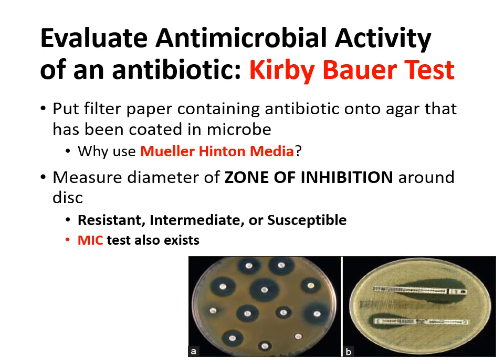When you do this test, you should be using a Mueller-Hinton media. So that means instead of the TSA plates that you've seen us use for a lot of our other experiments, you would use Mueller-Hinton media. The reason you do this is basically it has the same nutrients in it and food sources for the bacteria that you would find in the TSA plate, but it does not contain anything that might inhibit or break down antibiotics. Whereas if you use regular agar plates, sometimes their components will break down certain antibiotics, especially tetracycline.